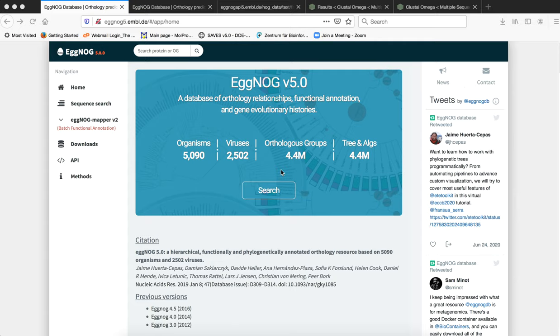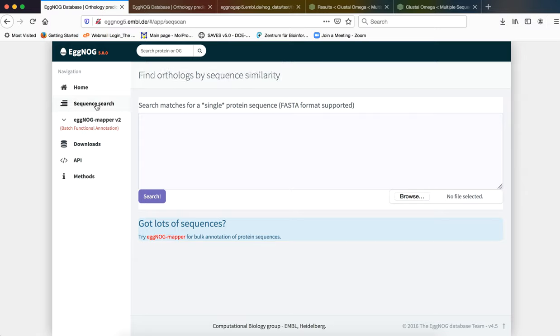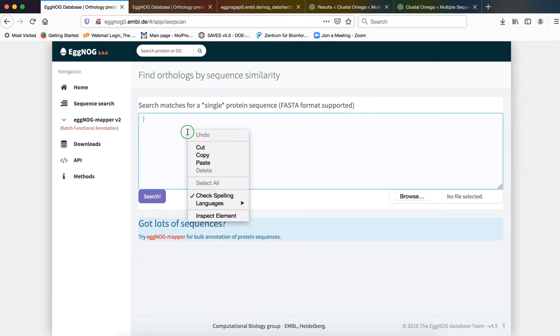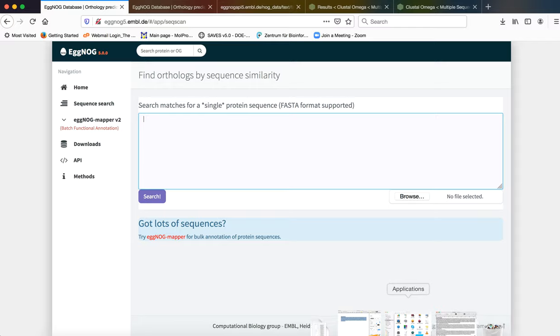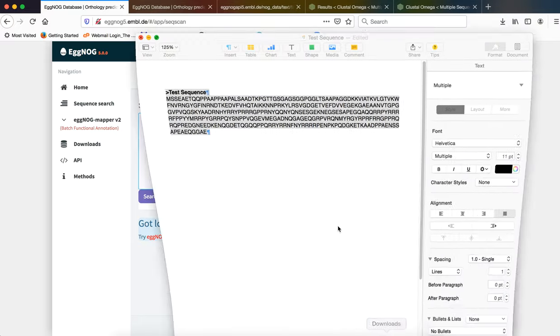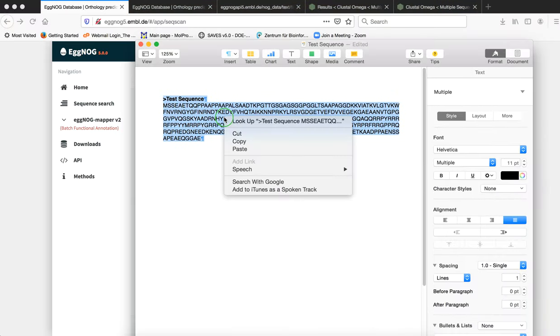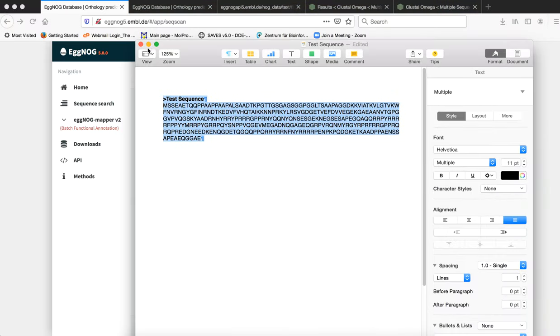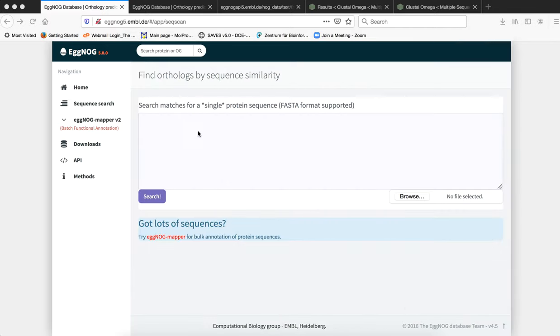Let us check out how we can submit our sequence. We will go to the option of sequence search in eggNOG and we will submit our sequence of interest which is our test sequence as we have been using for our analysis.